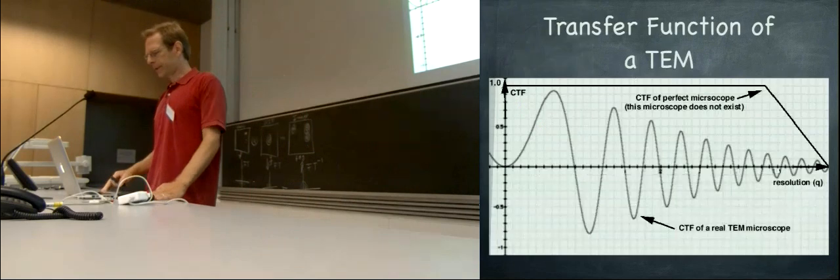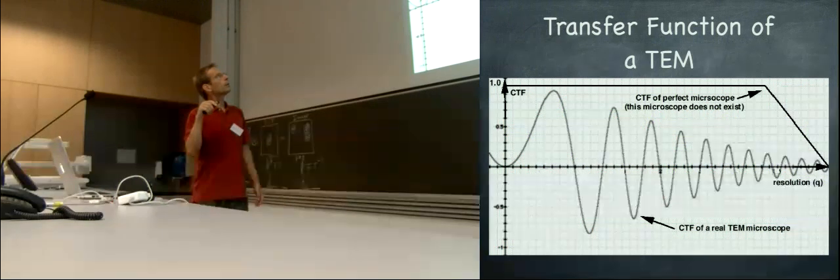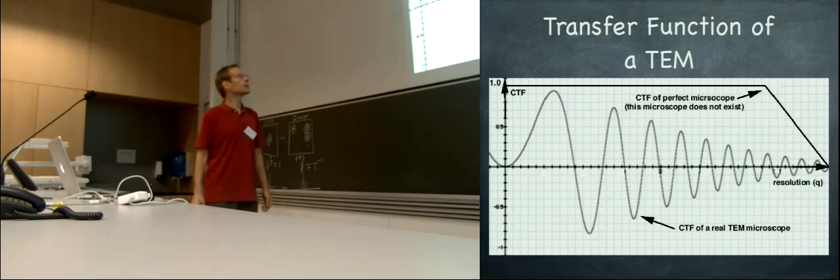Yeah? That's for sound. For electron microscopes, the transfer function looks absolutely pathological. Perfectly it would be 100% for low frequencies and high frequencies until we reach the resolution limit. But in reality, the electron microscope is close to zero, the phase contrast transfer function at low frequencies, then goes to some acceptable level, but then falls down to zero, and then even becomes negative. Yeah. And then finer, smaller things are invisible again, smaller things are white again, and then invisible, and then black. So this is what the microscope does to us.